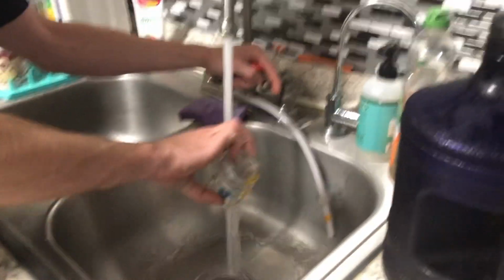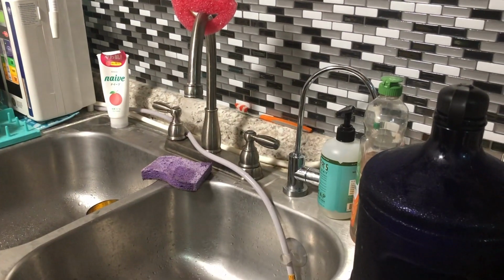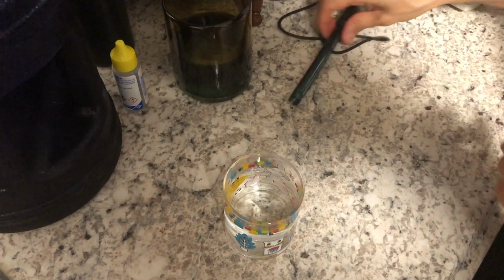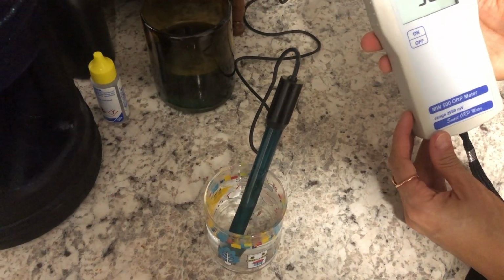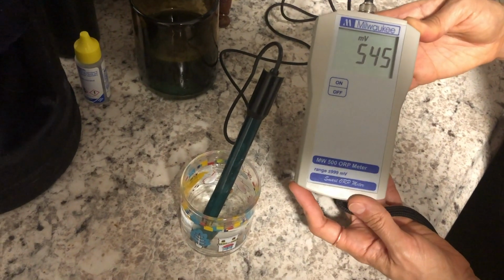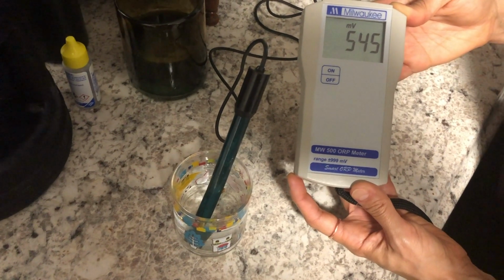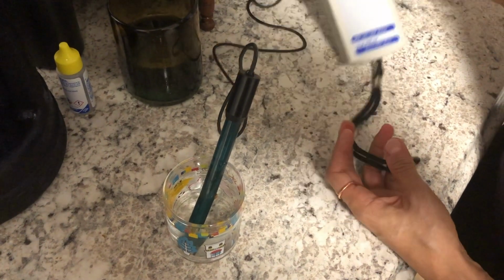Okay, first, I guess let's test the oxidation. Yeah, the ORP first. Can you help me here? Of course. Okay. Let's see. We have a positive reading. So anyway, we got a reading of 545. There you go, steady 544. There's where we are. Positive, which is pretty high. An oxidant is an oxidant.